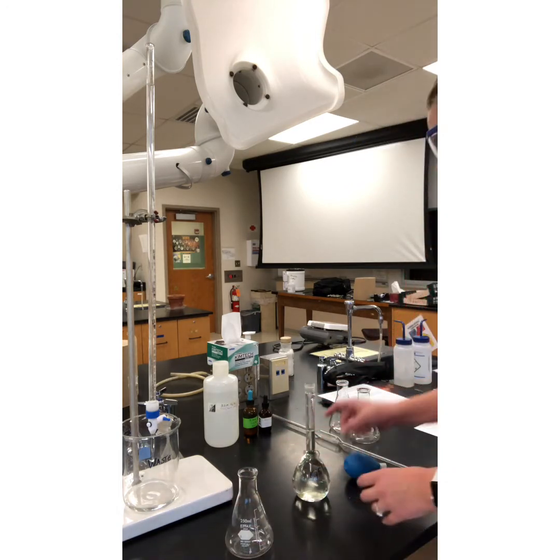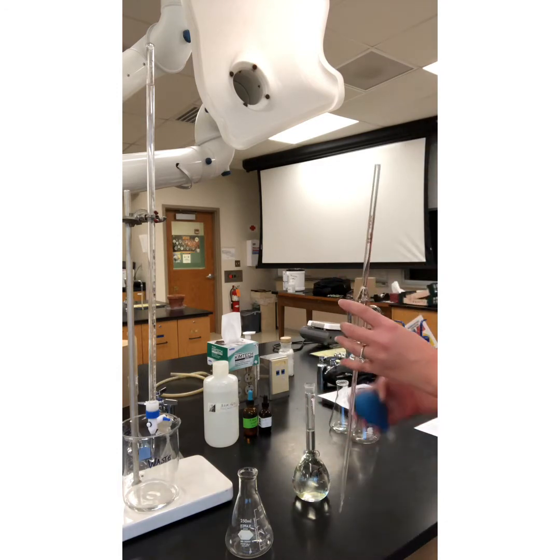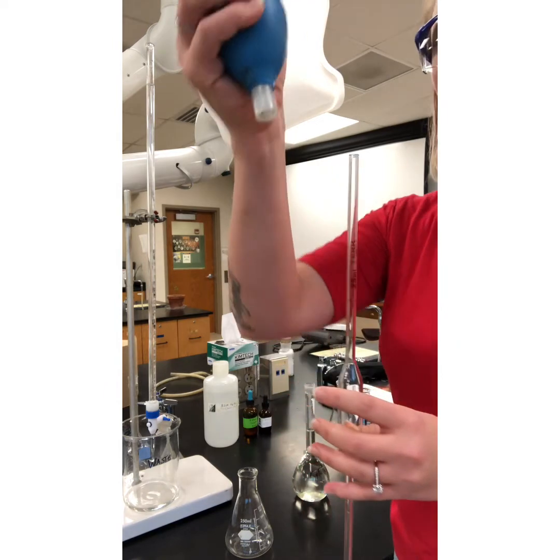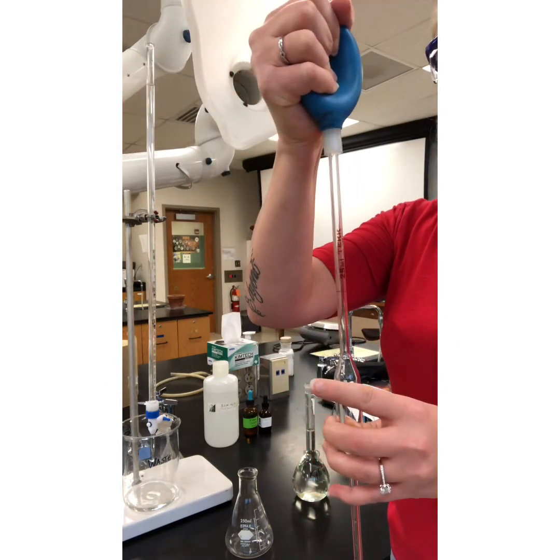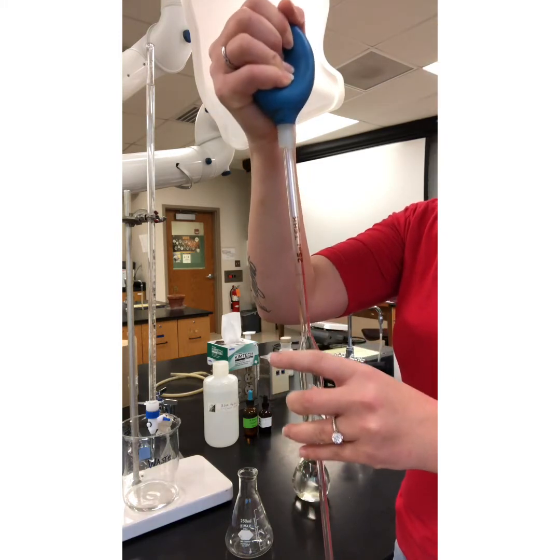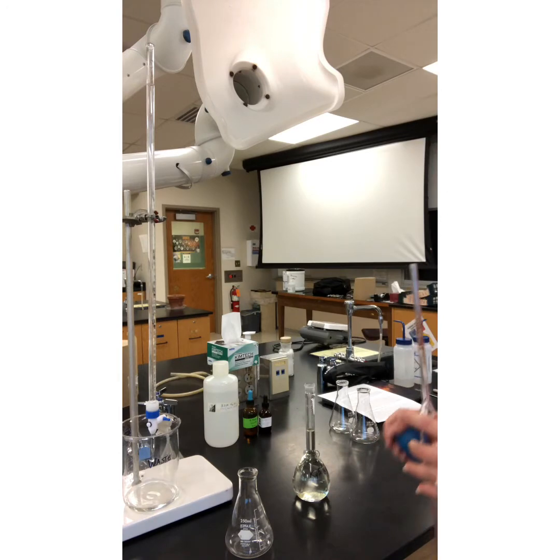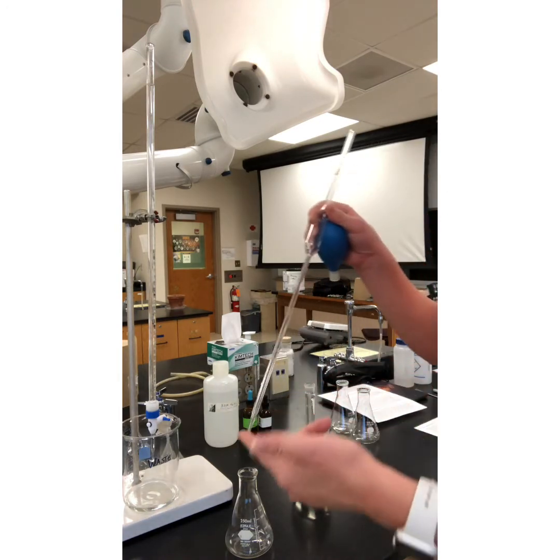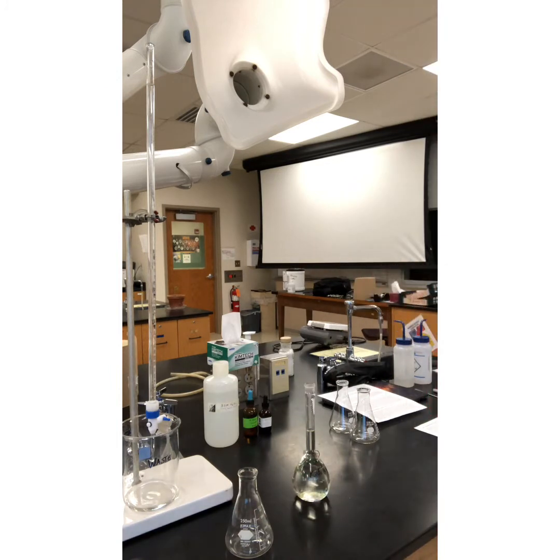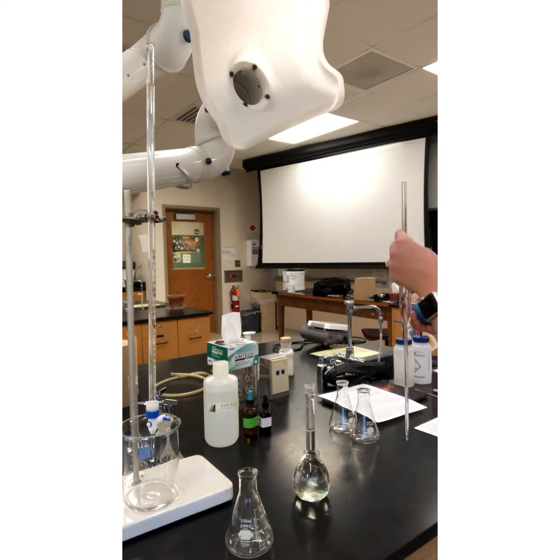Okay, so we've got our known solution of the potassium ferrocyanide. I'm going to use my pipette bulb. I'm going to push the air out, and then I'm going to put it on here, and place this in the solution. I'm just demonstrating right now, and that will suck my solution up from my glassware. You do want to be careful. You don't want to grind the tip of this into this piece of glassware, because you could break the tip, and it's expensive glassware.